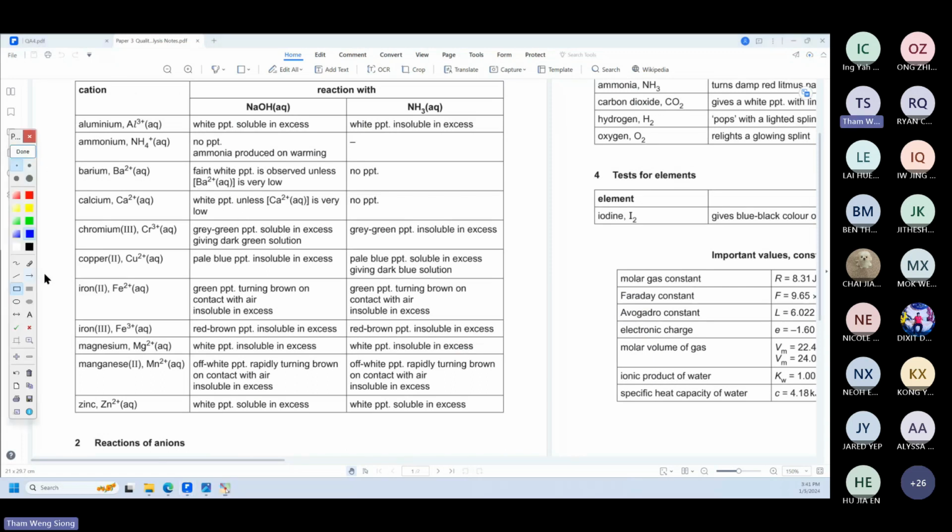I hope you guys will figure out it should be around the colored compounds already. It should be this area, because most of the cations are not colored. Make sense or not so far? So I already isolated out most likely either chromium, copper, or iron 3+. Actually, one of them is very evident already, but we'll just continue on now.